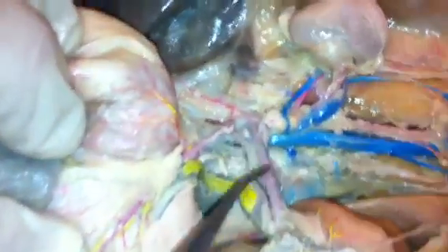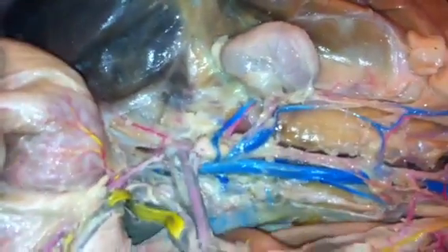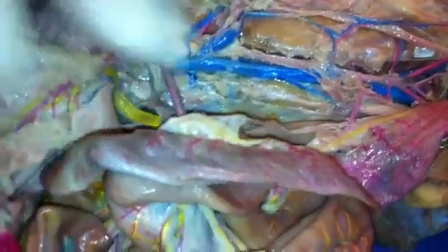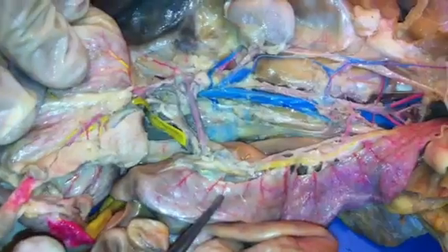If we come up above here, above the adrenal gland, we see 2 arteries here. This one, the more inferior one, is leading straight into the small intestine, and that's called the superior mesenteric. And if I fan out these, you can see all the little arteries in here were all being fed by this superior mesenteric artery.